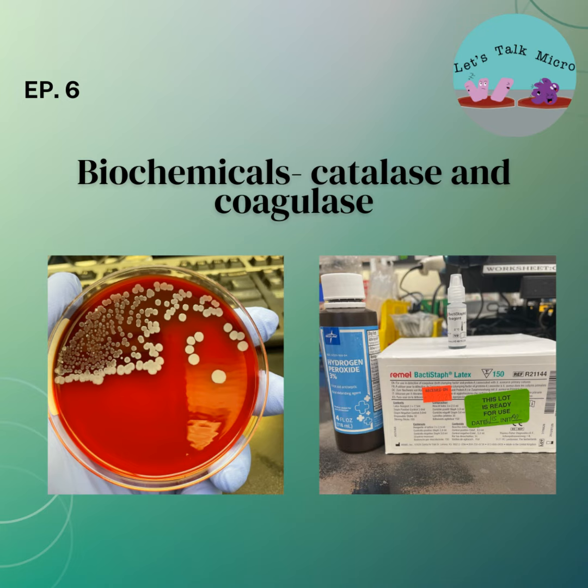So what's a positive reaction? A positive reaction is when bubbles are produced, and that's the release of the oxygen. Like I mentioned, that enzyme catalyzes the release of water and oxygen from hydrogen peroxide. So the oxygen being released is the bubbles that you see. You have to keep in mind that for a reaction to actually be called positive, it has to be a quick reaction, quick and strong. As soon as you add that drop or add the colony to the drop, you should see bubbles.